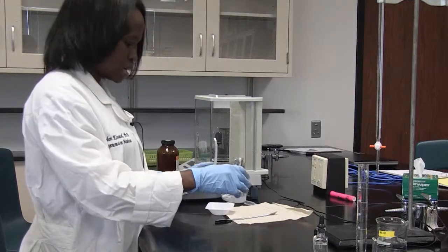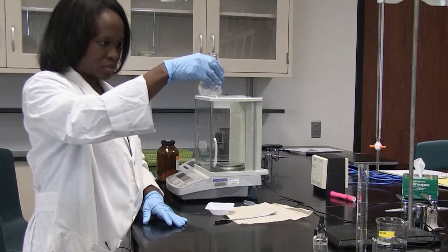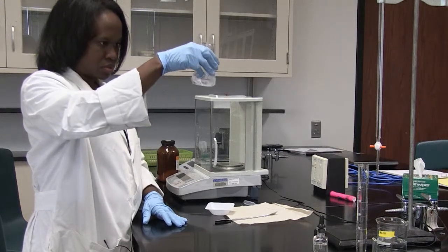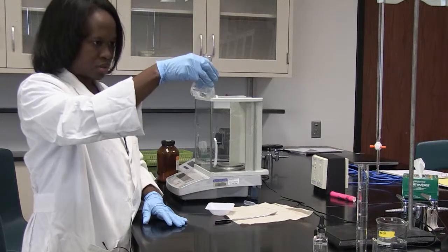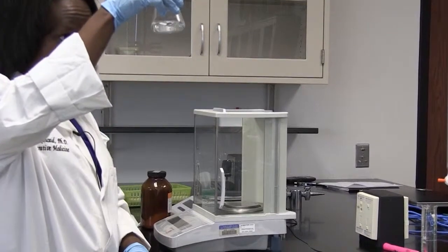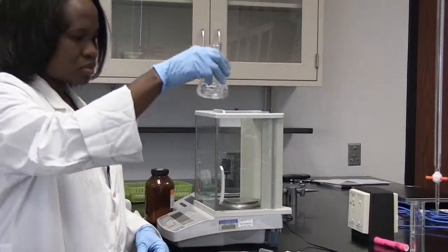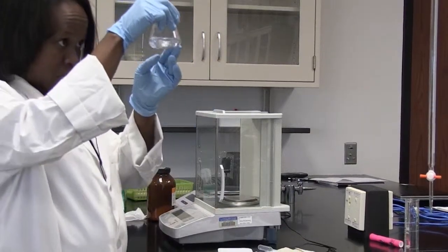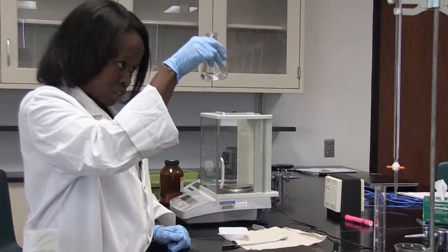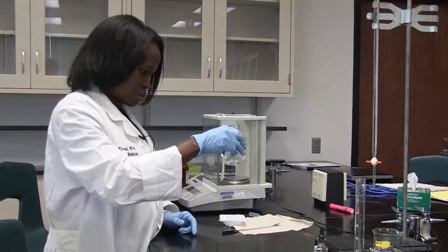I gently put the crystals in and I swirl in order to dissolve the KHP into the water. You continue to swirl until everything has dissolved. Also, you have left a little bit in the boat, so you need to make sure that you get everything. When this is dissolved sufficiently, I'm going to take a little bit of the KHP solution, put it back into my weighing boat, and using a transfer pipette, try to get as much of the crystal as possible back into the flask.